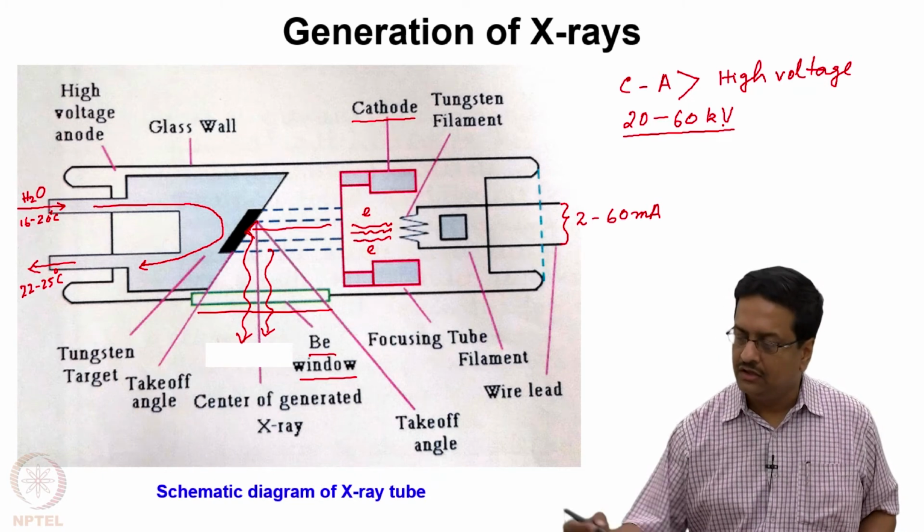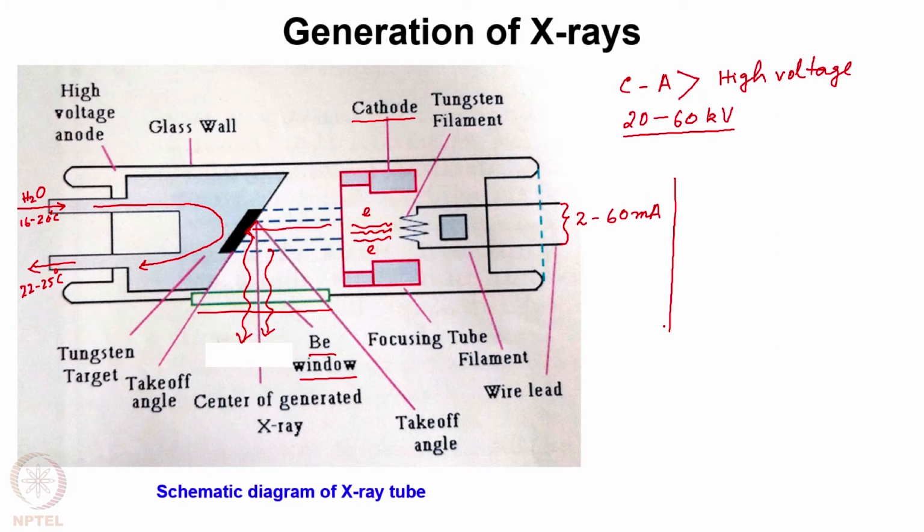So when we are using a standard X-ray tube, we keep it at the minimum, that is 20 kV, 2 or 5 milliamp, whatever the settings of the tube may be, and this is called the standby settings. So when we do not use the diffractometer, when we are not collecting any data, at that point we always keep the generator at the minimum voltage and current, so that the tube is always kept warm, and we do not switch on and switch off these tubes every now and then.